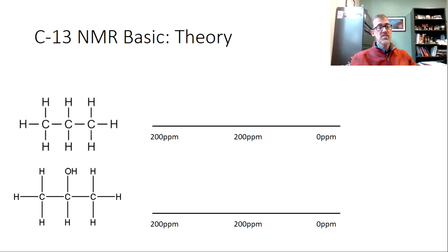But to make sense of the type of spectra, and we'll draw a few here in a moment, the energy that it takes to excite a nuclei against the magnetic field, and correspondingly the energy you get emitted when they relax, those are the same values, those are dependent on the magnetic field strength. Okay? But we're using the same magnet for every molecule and every atom in the molecules. So where we learn something about what this molecule looks like is that within the molecule they all have their own subtly different electromagnetic environments.